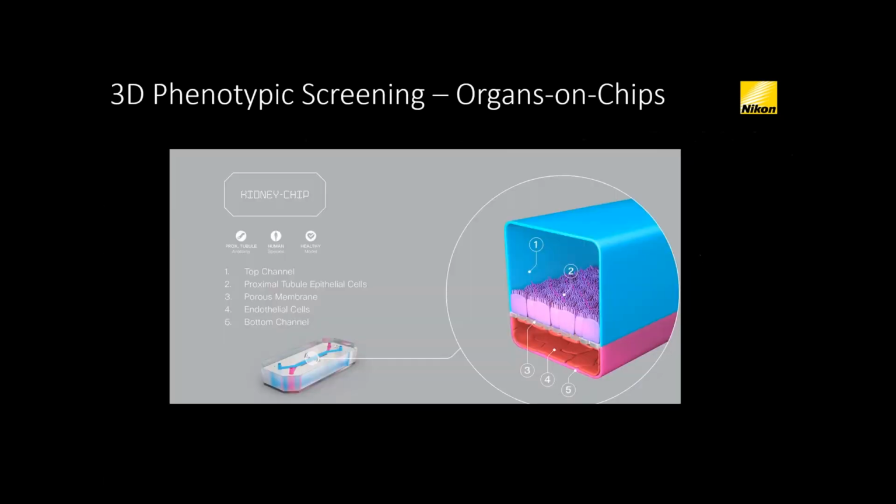So we start out in this video going from the basement membrane. So what we're going to do is we're going to go, or the basement of this luminal compartment here. So we're going to start here and we're going to move through.